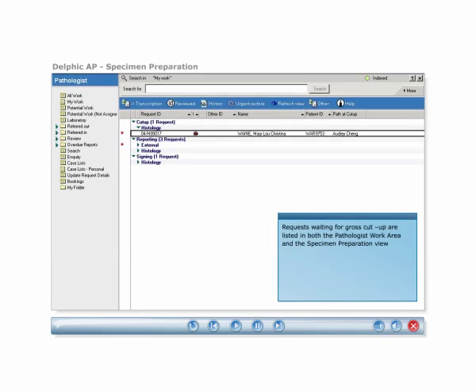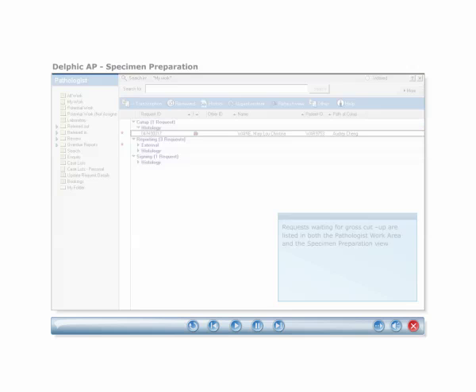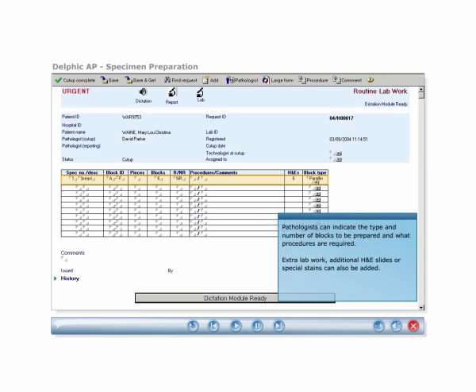Requests waiting for gross cut-up are listed in both the pathologist work area and the specimen preparation view. Pathologists can indicate the type and number of blocks to be prepared and what procedures are required. Extra lab work, additional H&E slides, or special stains can also be added.